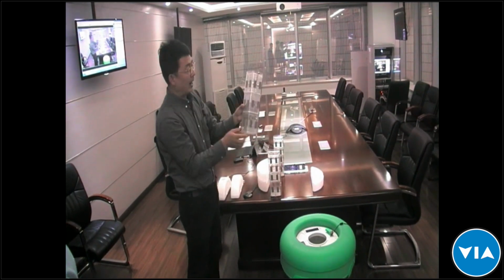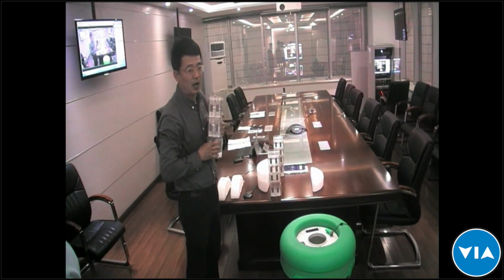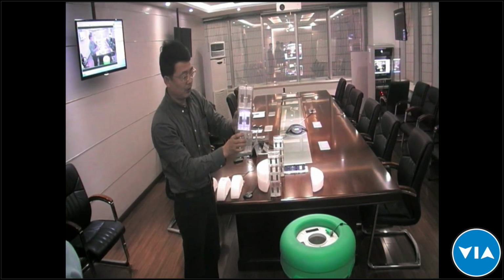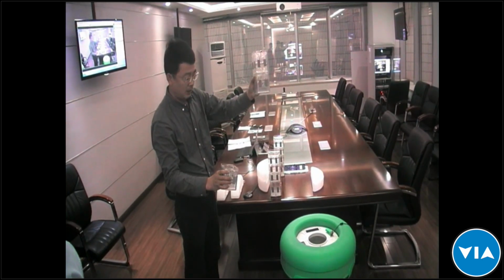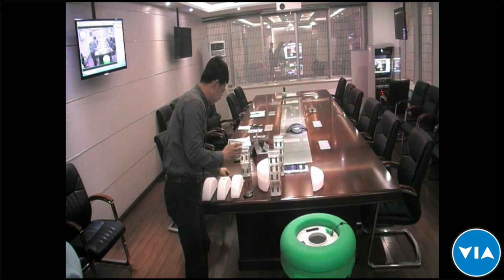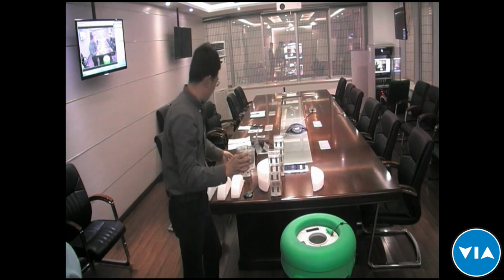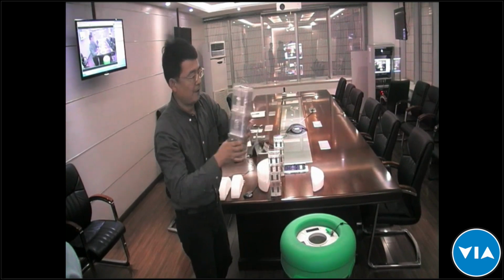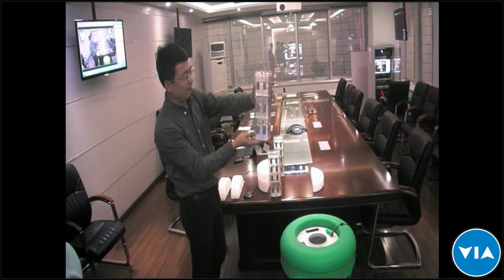The larger one consists of three cups. You can take them apart just as we do, separate them, and place the vaccine vials into them. And after that, you can put them together into a set of vaccines. Okay, that finishes the middle vaccine deck.